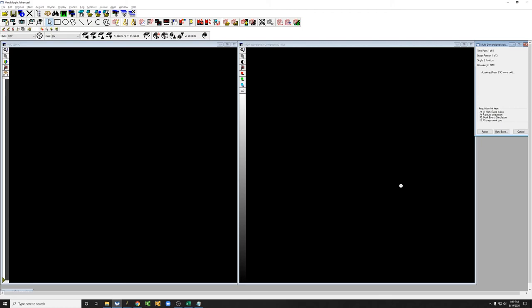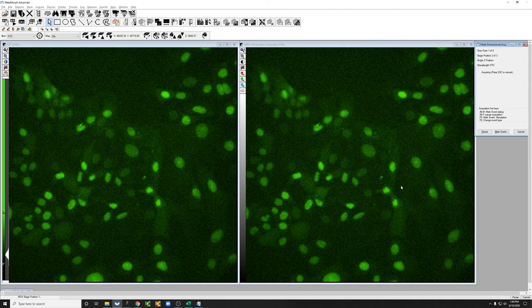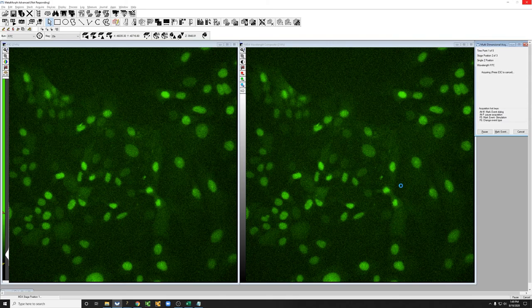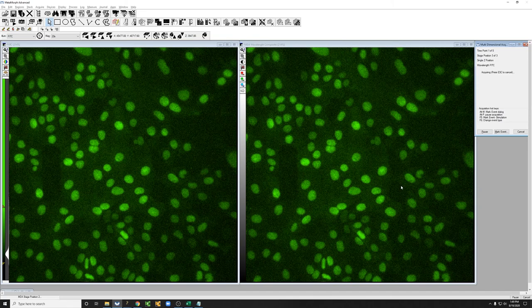It'll go to the first position. You heard the beep. That's the autofocus. It's going to go to the second position. That's the beep of the autofocus. There's the second position.